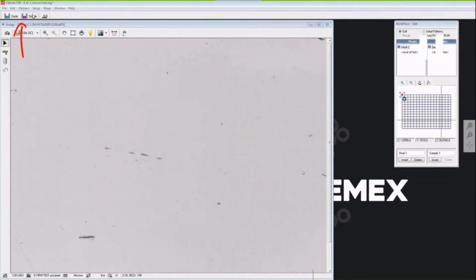So what we're doing here is basic thresholding for oxides and sulfides. By doing so, we will be characterizing the sulfides, which are lighter in color, and the oxides, which are darker. After we characterize that, the software will then be able to divide the oxides into 3 more inclusions: silicates, which are smooth in shape, aluminas, which are rougher, and globulars, which are round.